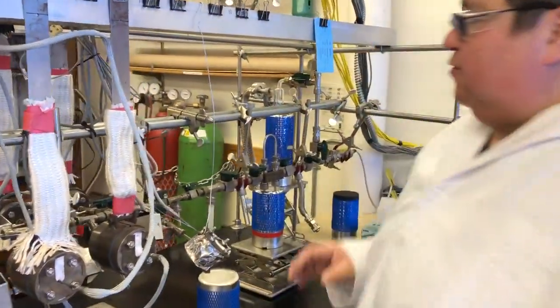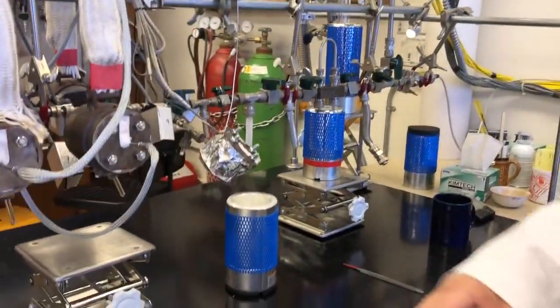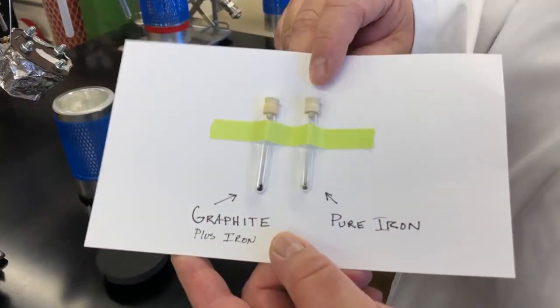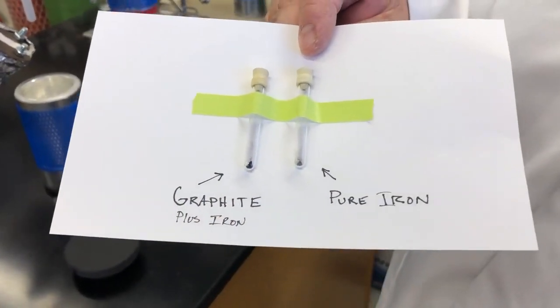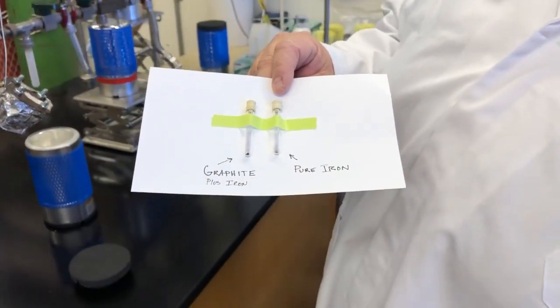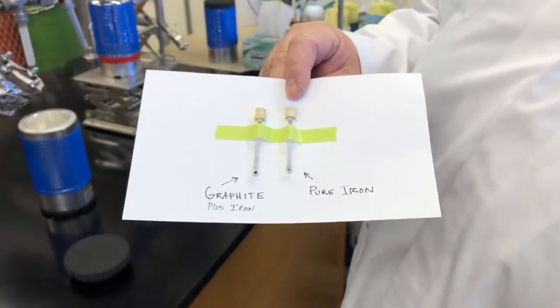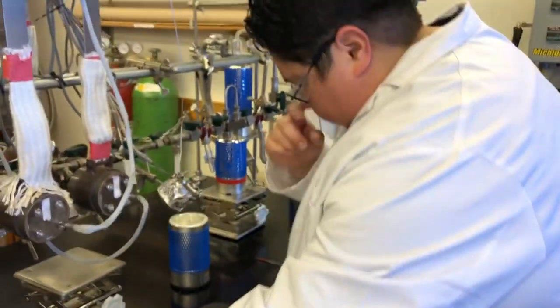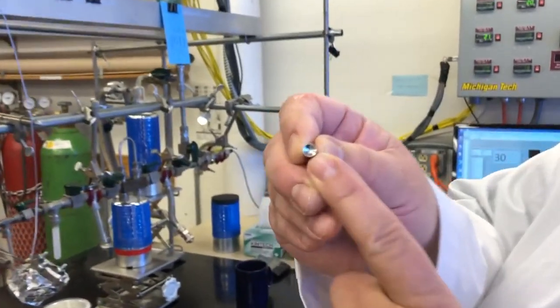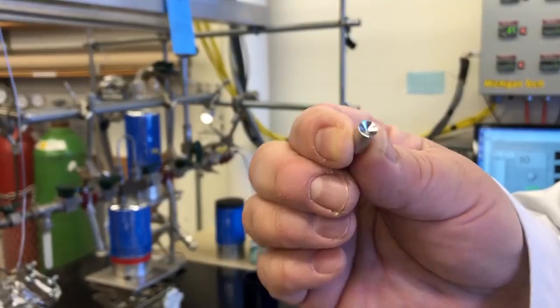Okay, so we let the reaction go to completion, and what I end up with is a tube that I can pull off the rig cap, and it's got graphite in it. And just so you can see what the iron looked like before, you can see there's a pretty good difference between the iron and the graphite. So now that's not quite ready to go. What I need to do next is to pour that graphite into this tiny little hole that I drilled into an AMS target. So I'll pour the graphite into there, press it, and ship it off for measure. And then we're done.